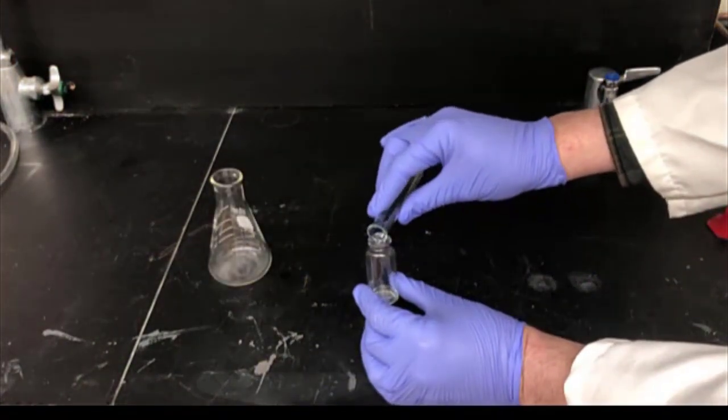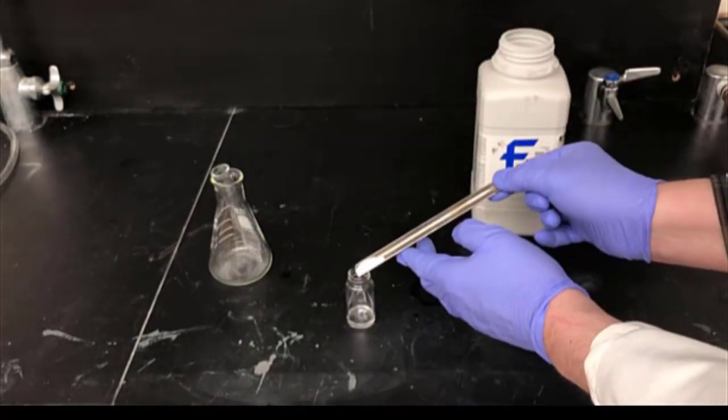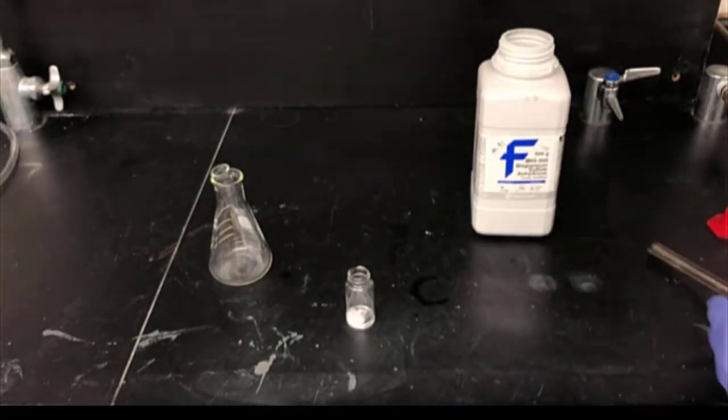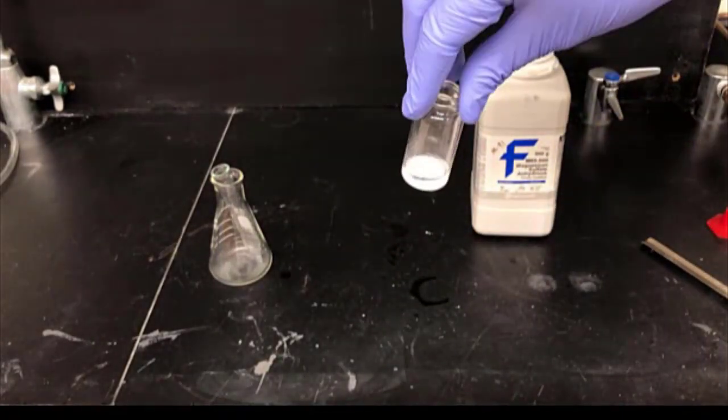Next, pour the solution into a clean dry vial. We'll dry the product mixture with magnesium sulfate. Add enough magnesium sulfate to make a thin layer on the bottom of the vial. You'll know you've added enough if you swirl it and the magnesium sulfate remains free-flowing.